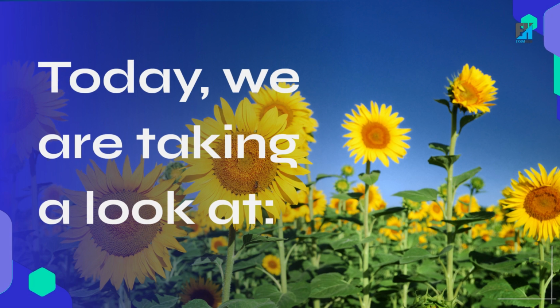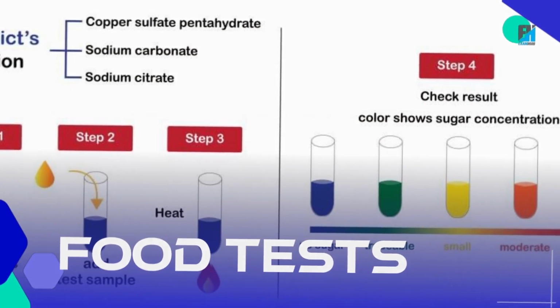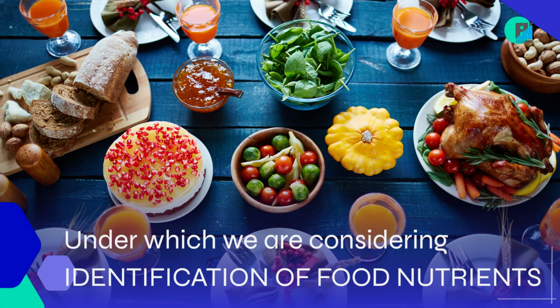Today, we are taking a look at food tests, under which we are considering identification of food nutrients.